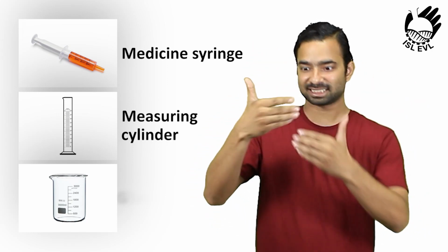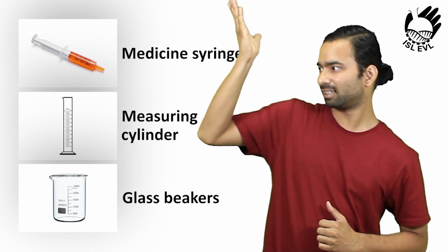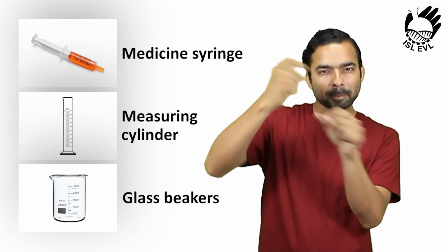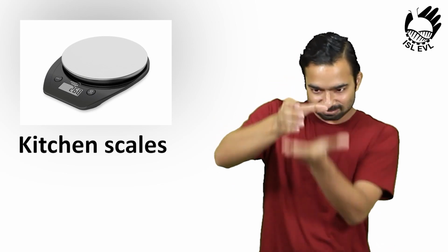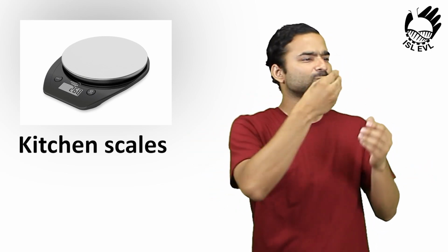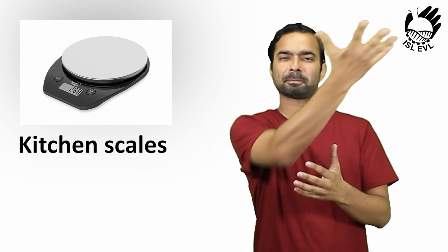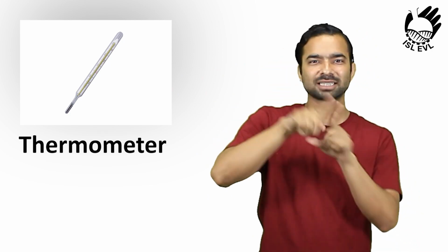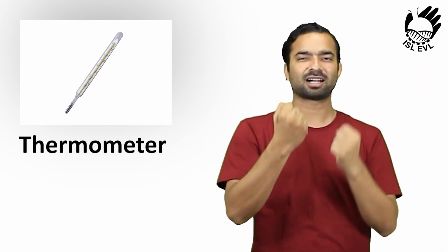Materials required for this experiment: clear plastic disposable cups, for example, beakers. The 5 samples, for example, table salt, sugar, alum, potassium nitrate, or Epsom salts. Half a cup of each sample is sufficient.